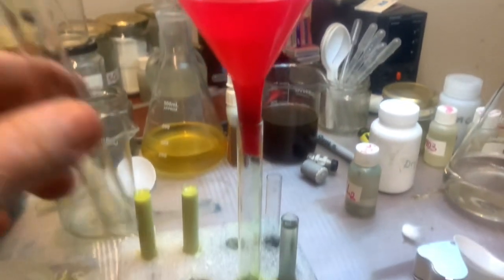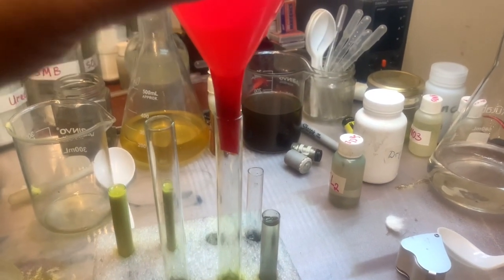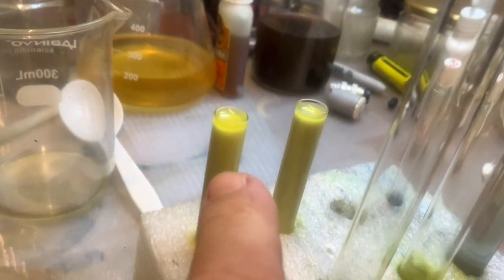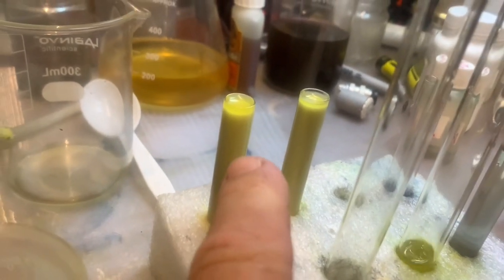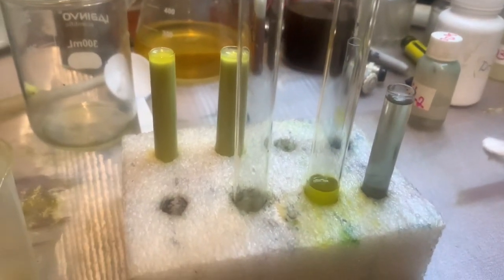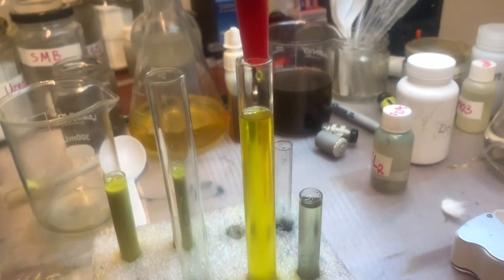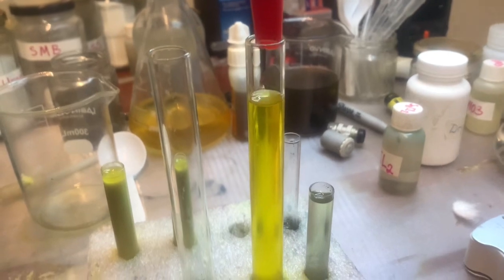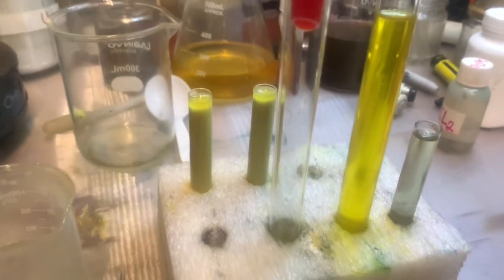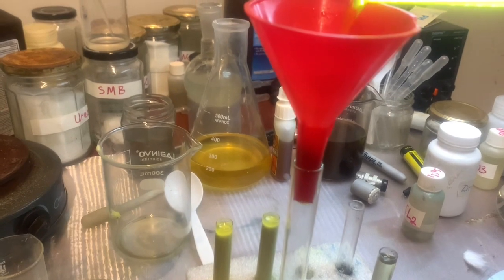Okay, let it work. I'll turn it on when I'm done. And right now this one's settling down, but I took almost everything, so that's mostly silver chloride. And maybe there's some sand somehow. Okay, so now filtrated and a little bit cleaner, you can already see. So I think I need to make it even, it's still there, so a little bit, take like half of that.